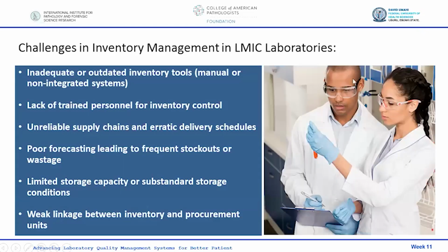So what are the challenges of inventory management in lower middle income country laboratories? Well, there are many, but these are the few I will mention, and I'm sure that all of us that are in the lower middle income country here can relate with that. Inadequate or outdated inventory tools, that is the manual or non-integrated systems. That is what is common in our environment.